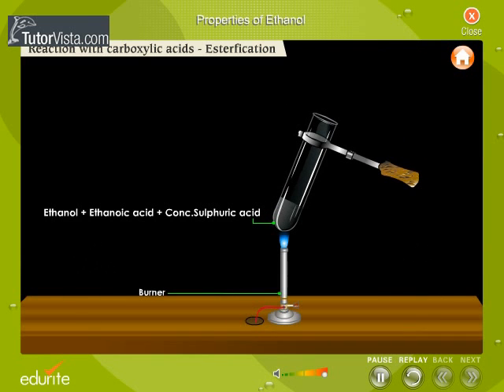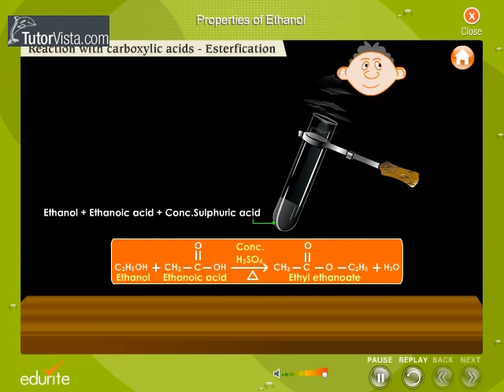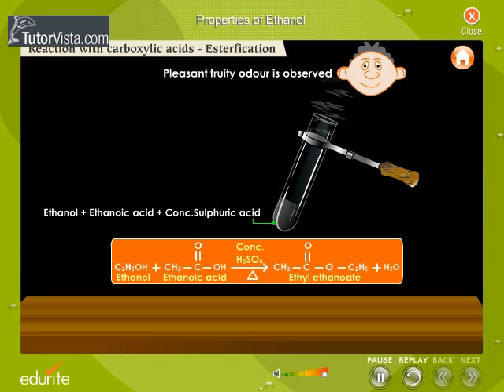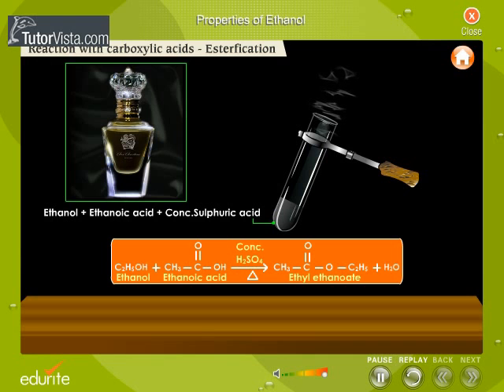Then a few drops of concentrated sulphuric acid are dropped into it. The test tube is heated gently. Gradually, a pleasant fruity odour can be observed. The fruity odour confirms the formation of ester. Most esters have a sweet smell and they are generally used as flavouring agents in jams, jellies, toffees, squashes, etc.